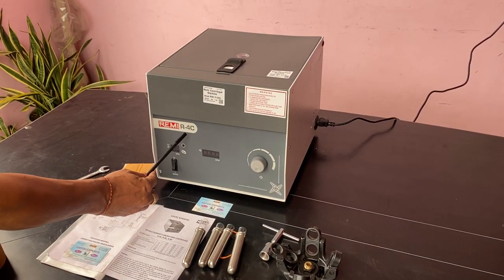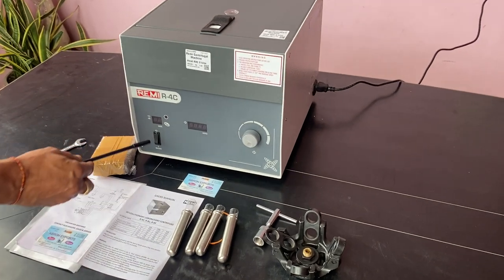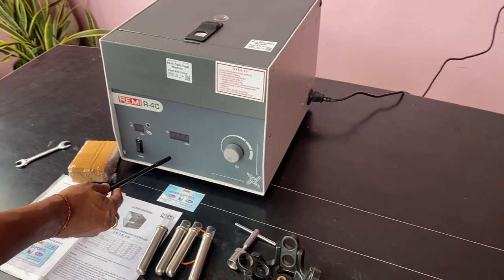This is the Remi R-4C Centrifuge supplied by Abron Exports. This model has a 4000 RPM speed.